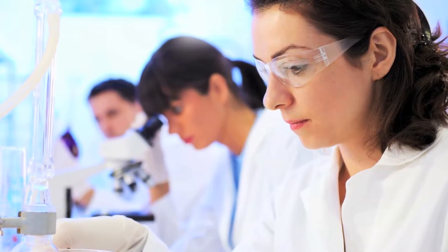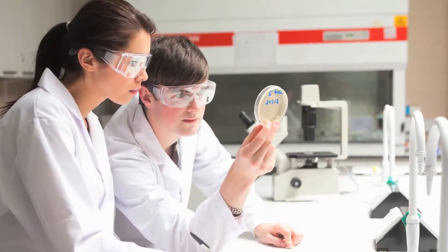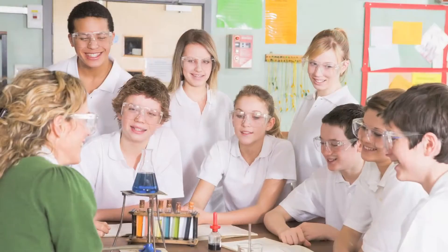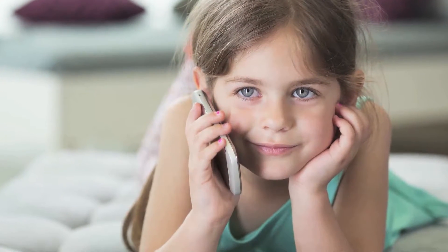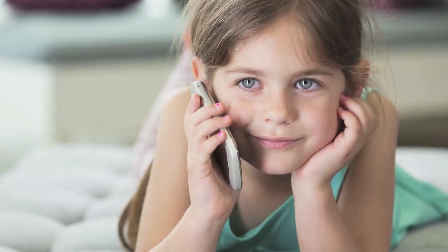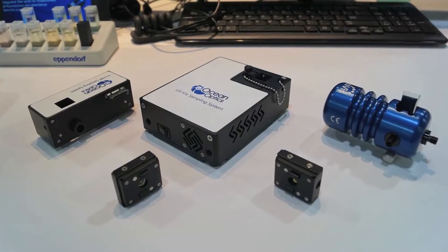At OceanOptics, we believe that tomorrow's scientists start with today's students, and we want to help you as educators bring exciting hands-on experiments to your classroom with modular spectroscopy. But how exactly can we inspire the most tech-savvy generation in history to become pioneering scientists and engineers? We believe it's by engaging them with cutting-edge tools.